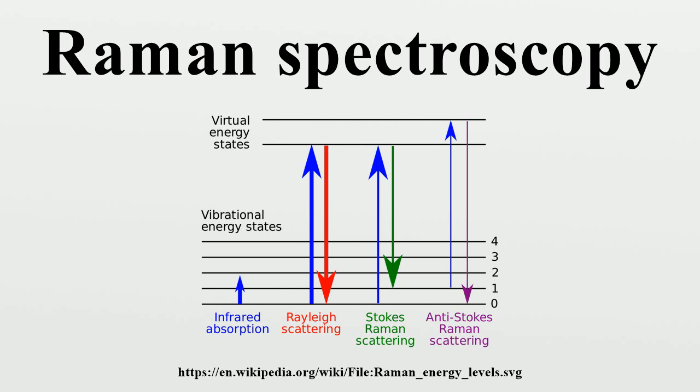In those instances, one can use a technique in inelastic incoherent neutron scattering to determine the vibrational frequencies. The selection rules for inelastic incoherent neutron scattering are different from those of both infrared and Raman scattering. Hence, the three types of vibrational spectroscopy are complementary, all giving in theory the same frequency for a given vibrational transition, but the relative intensities giving different information due to the types of interaction between the molecule and the electromagnetic radiation for infrared and Raman spectroscopy, and with the neutron beam for IINS.